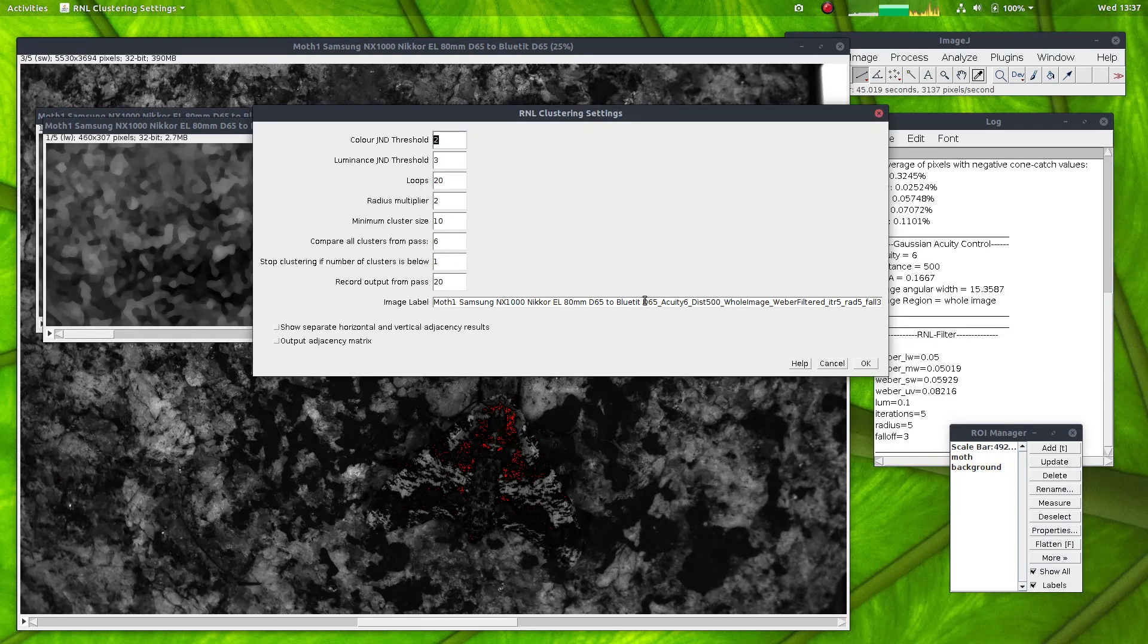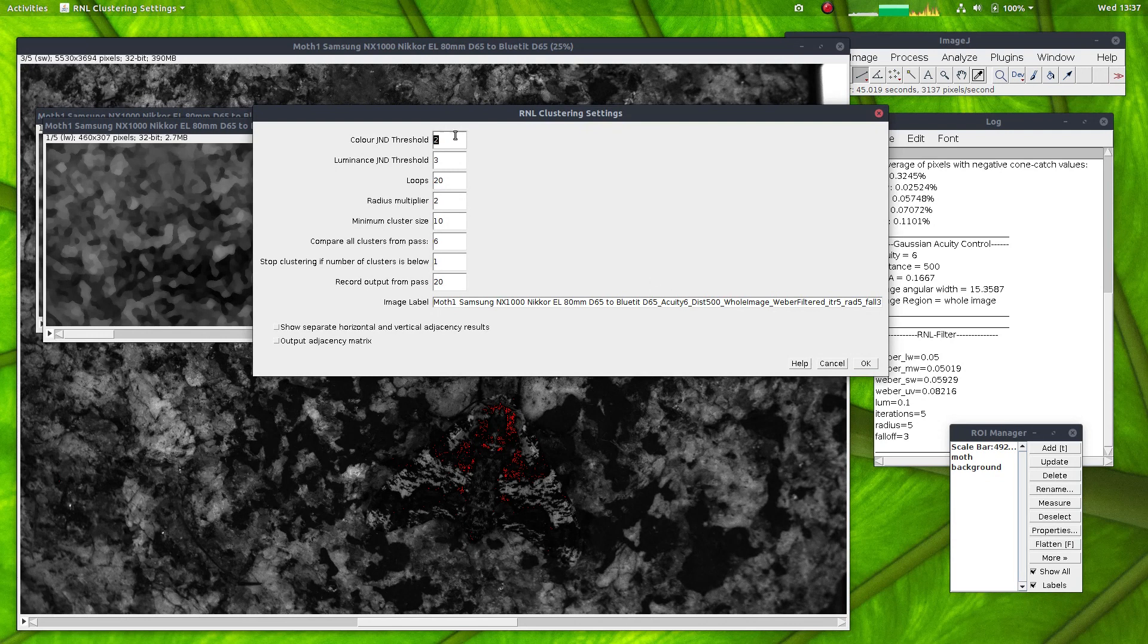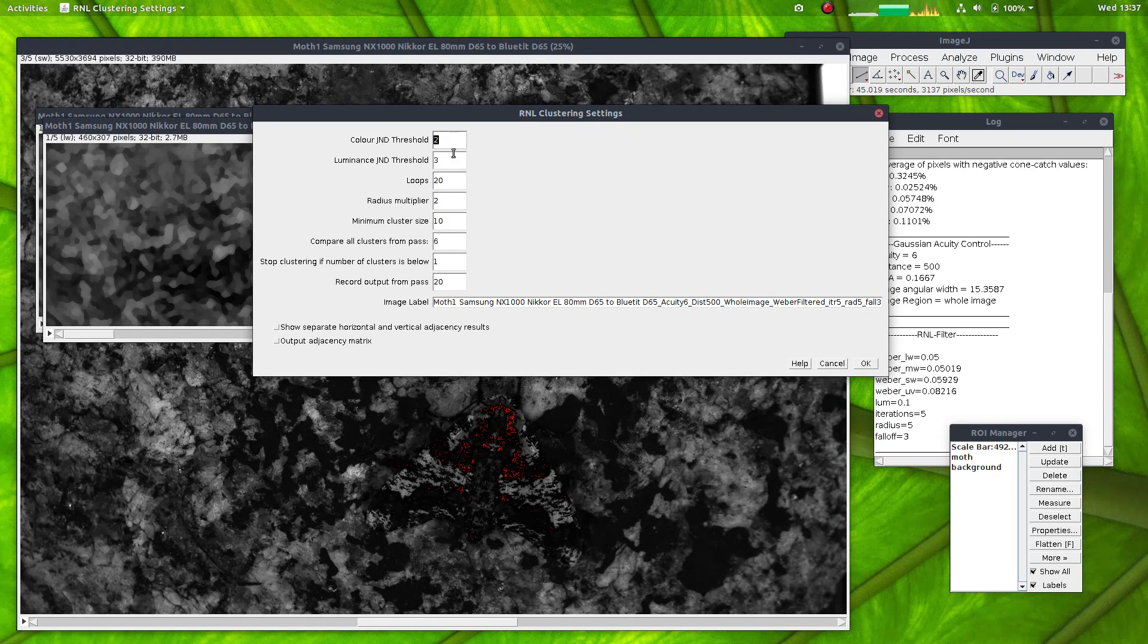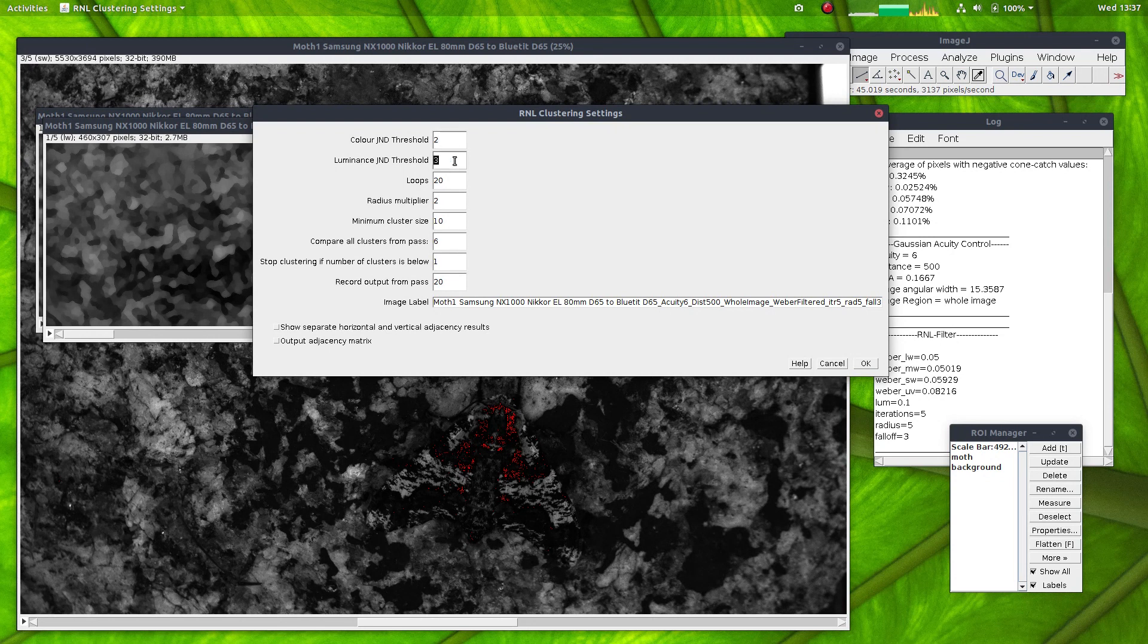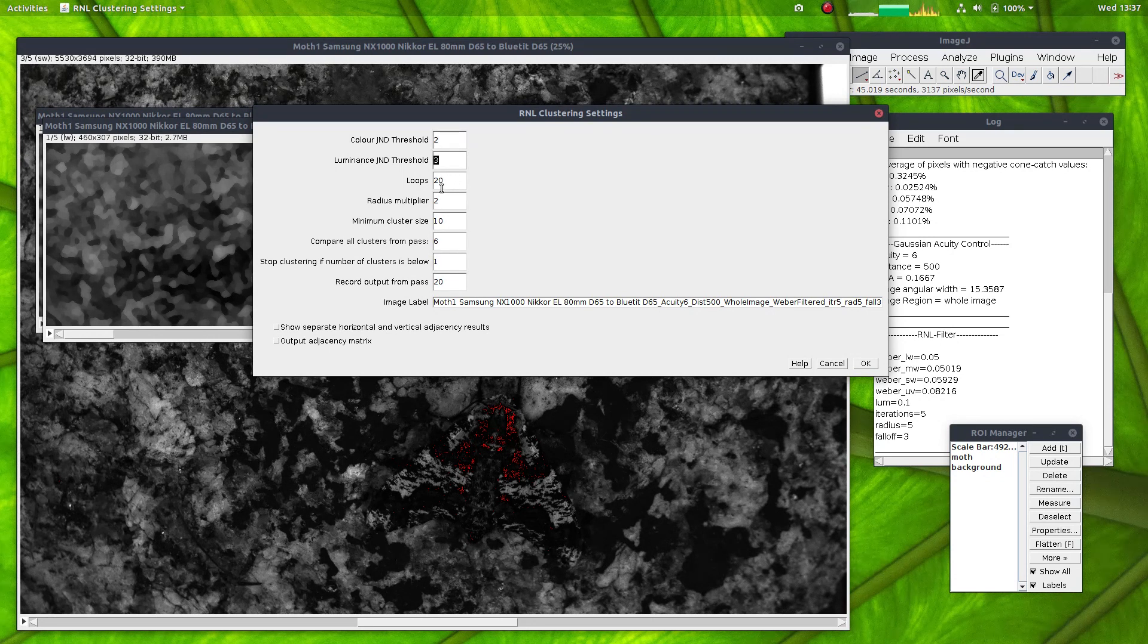Okay, now that's finished, it's brought up the clustering settings, and I'll just go with these settings. So we have the chromatic and achromatic thresholds, and all of these default settings here.